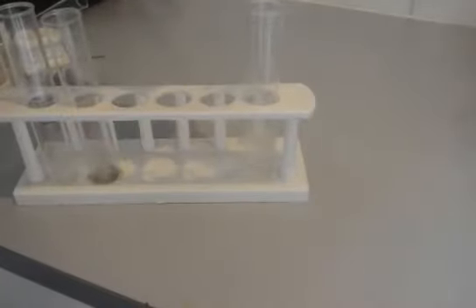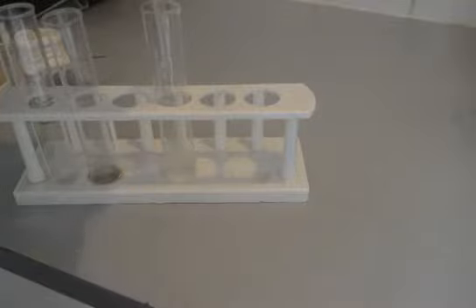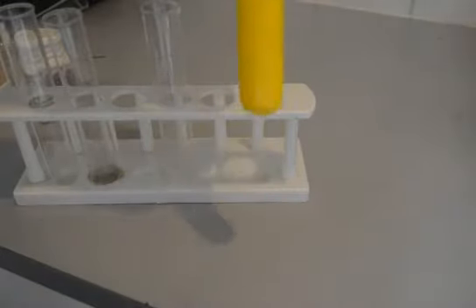And we're going to form potassium nitrate and lead iodide, and one of them is going to precipitate out of solution. Just focus that in. So here we go, and there we get our precipitation there. Nice, lovely, creamy yellow colour.